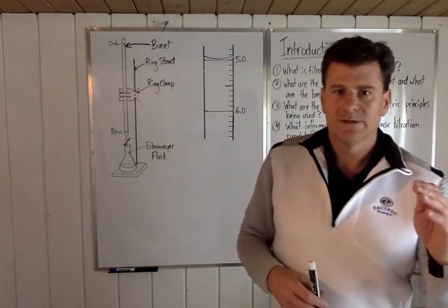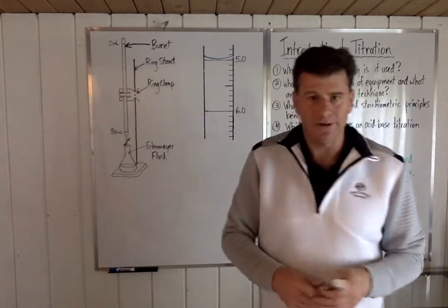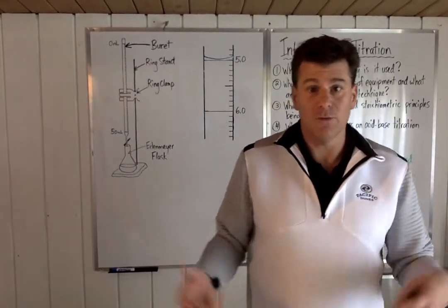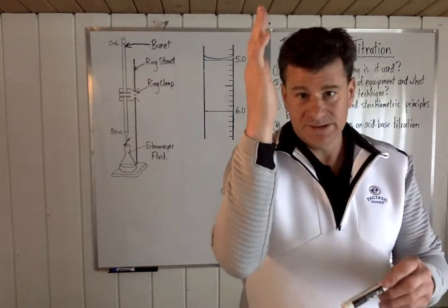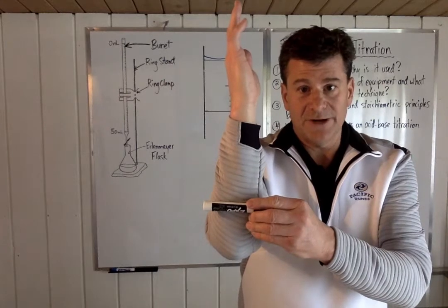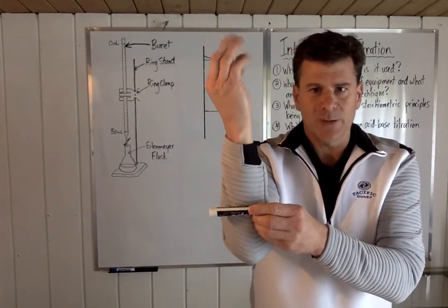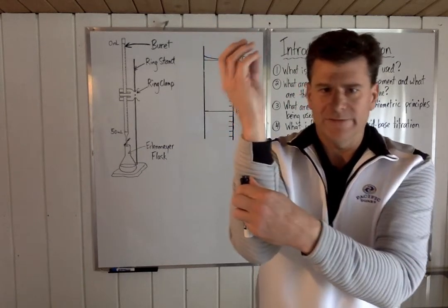Another thing about the burette, before I get into the actual measurement over here. When you first fill your burette, like when you're starting your whole thing, you've got the little stopper closed, right? So here's the burette and the valve down here, and you start with it closed, obviously, because if you're going to fill up here at the top where my fingers are, you don't want the thing open, so you're pouring in whatever solution you're pouring in.